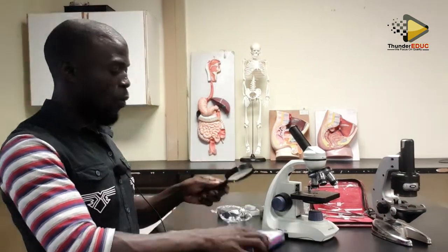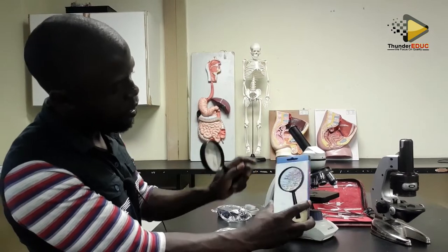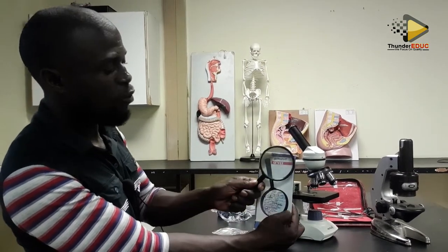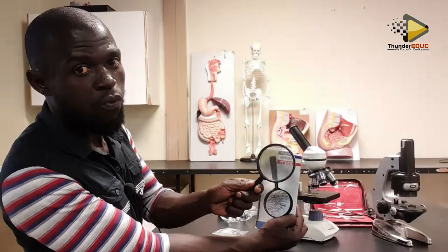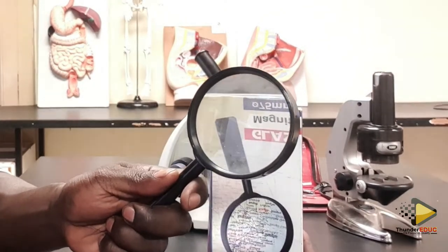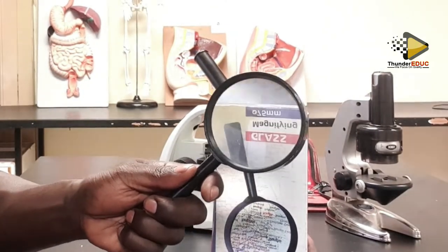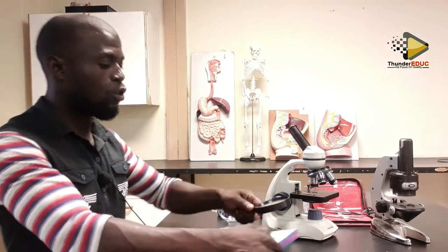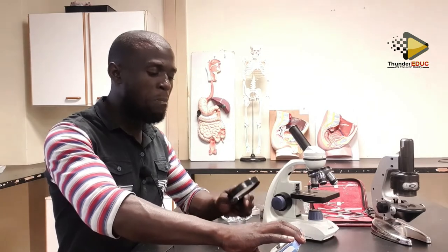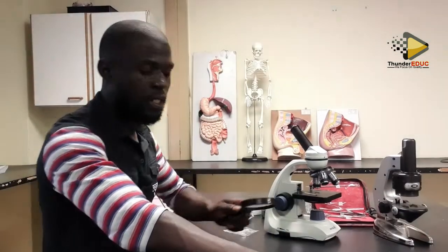When you're using a simple microscope, you put it on something you want to view, and then you move it. As you move out, it becomes bigger. When you move back, it becomes smaller. So it depends on how much you want to magnify it. We call it a simple microscope and lens. Sometimes we call it a magnifying glass, but it's the same thing.